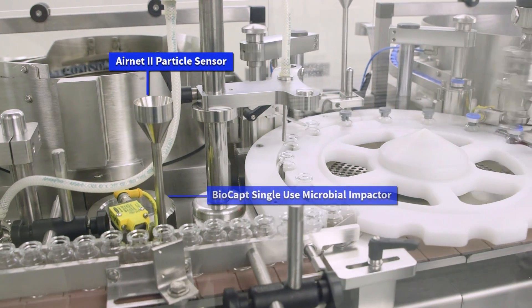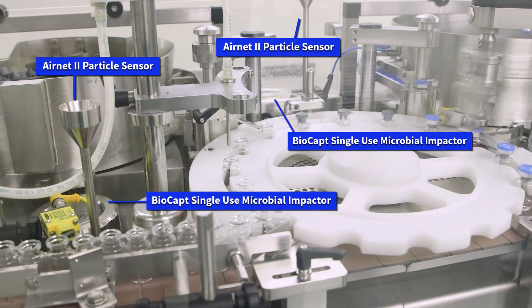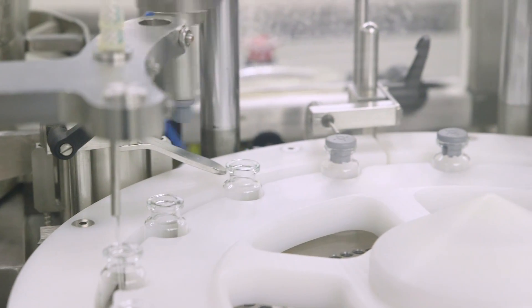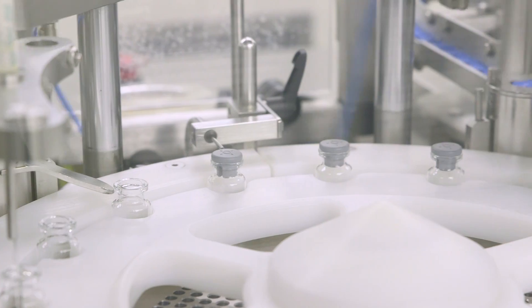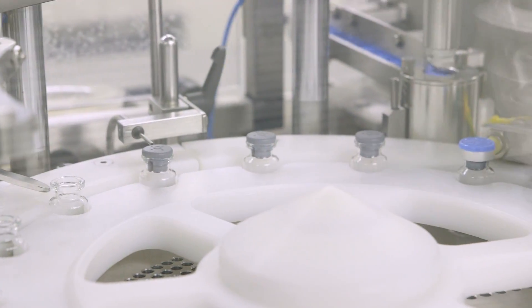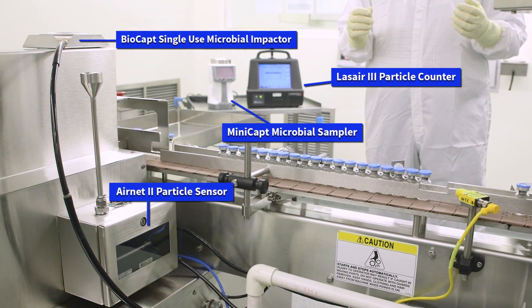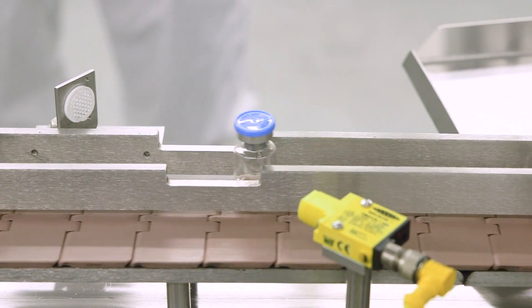One of the most critical areas to monitor is where the vial is filled with the product. Monitoring the filling process continues through the stoppering and capping steps. Once the vials are capped, they are conveyed to a collection area where monitoring continues.